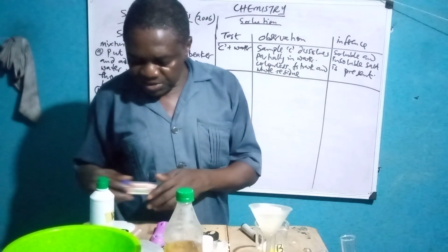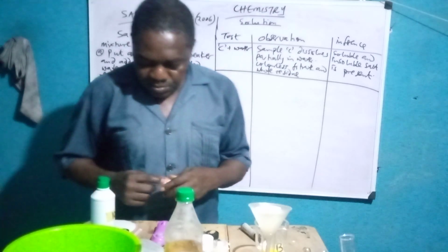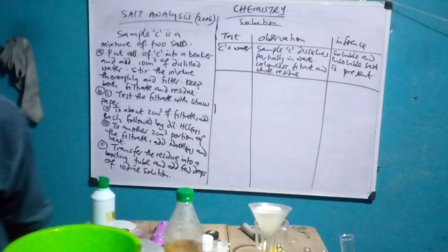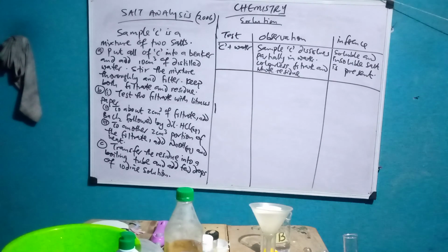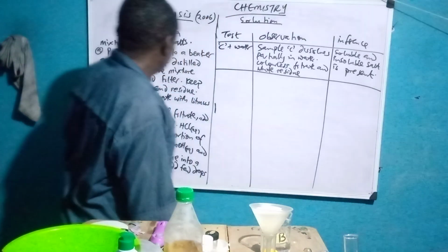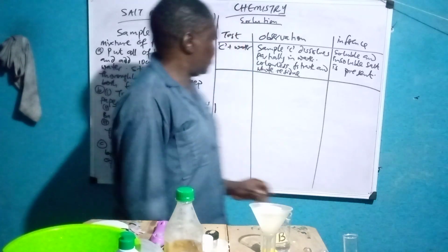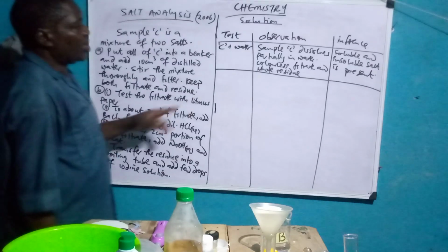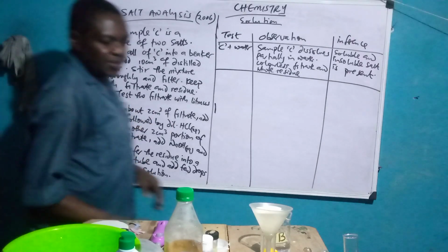So we bring the filtrate. Test the filtrate with litmus paper.